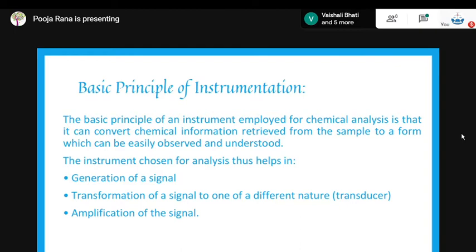Now, from a single droplet of blood, they have demanded that we want DNA analysis also. So we want DNA profiling to be done from that particular droplet of blood that we have forwarded to you. Now, from that blood droplet, it is possible to give the qualitative analysis that yes, this particular sample belongs to a human. We can even perform the grouping also, to find which blood group it is. We can determine the species also, but we cannot determine the DNA from that sample, because the sample will be consumed wholly.